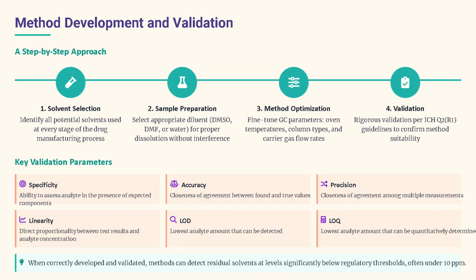But even with the best equipment, there are challenges. Sometimes solvents co-elute, meaning their peaks overlap, making quantification tricky. Other times, residual solvents bind tightly within the crystalline API and require special heating or derivatization steps to release.